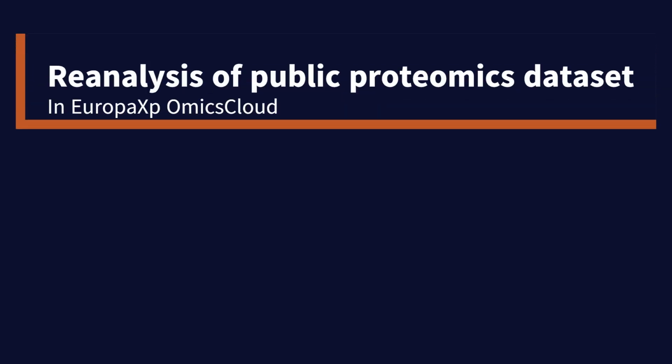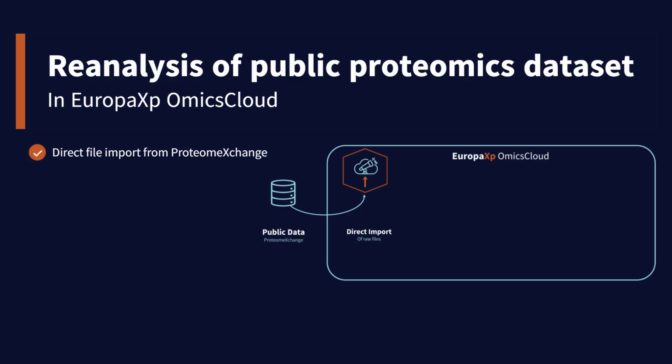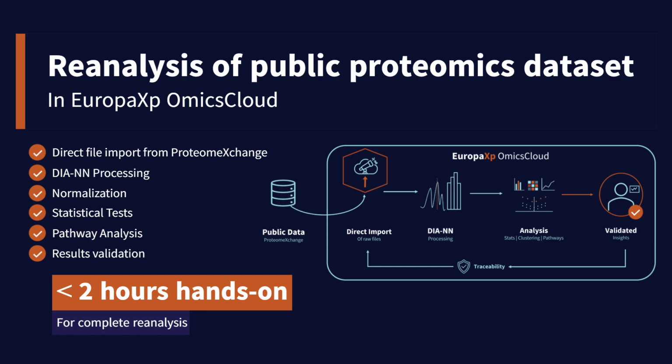Well, there you have it. That's a complete reanalysis of a published DIA proteomics dataset, raw files pulled from Proteome Exchange, processed through DIA-NN, normalized, statistically tested, pathway analyzed, and validated at the peptide level. Every protein and every signature available for inspection. Total hands-on time, less than 2 hours.